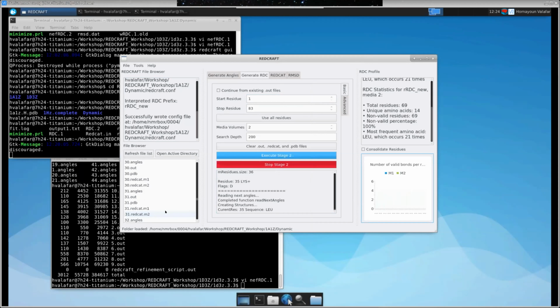Is there a percentage depending on the number of residues? Or you said two RDCs per residue on average is needed? Right, so this becomes another advantage of the RDC approach versus the NOE approach. If I was to ask an NMR expert, how many NOEs do you need in order to unambiguously, theoretically, be complete in structure calculation? That answer is unknown.